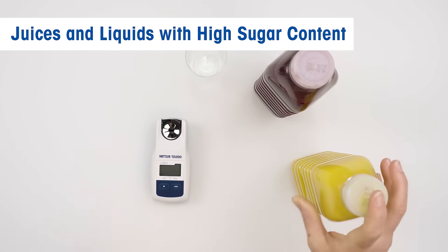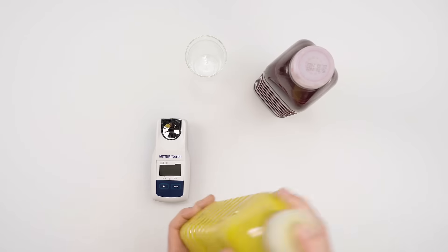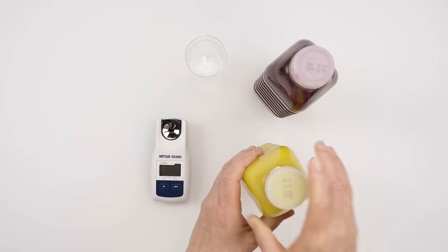When dealing with juices and liquids with high sugar content, always mix and stir to homogenize the sample.